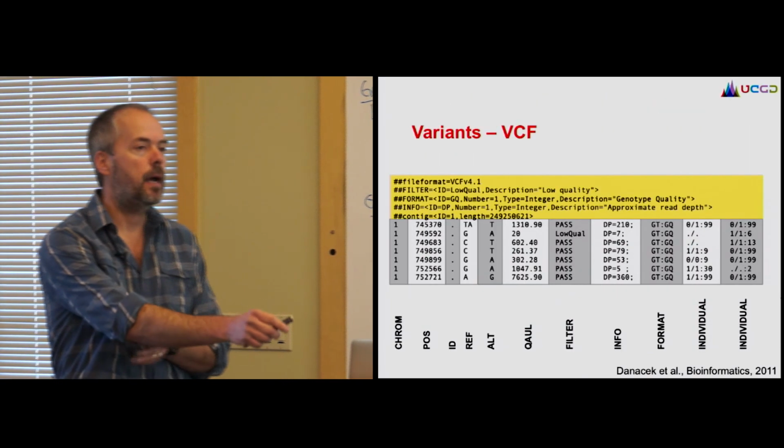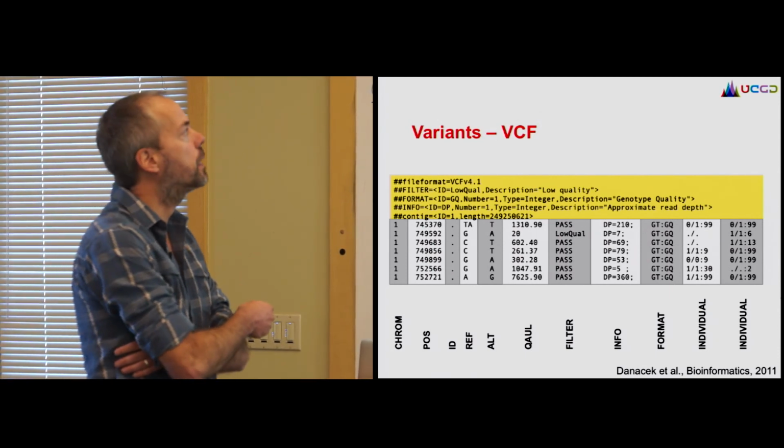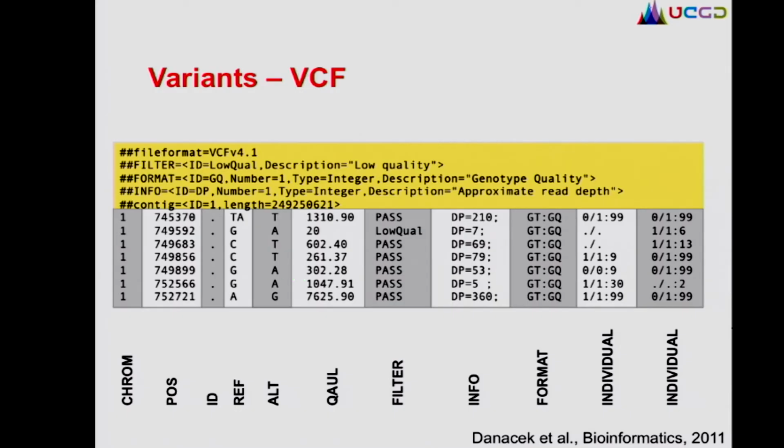Okay, so enough of that. I think you've probably already seen variant files and other types of files already this week. So we'll just briefly refresh our memory. The VCF file is where the variants are, some metadata at the top, tab delimited columns of information about each variant at the bottom. The initial data early on describes where the variant is, what it is, and a few bits of details about it. And then we have down at the end here this open-ended number of columns that describe for each individual in our data set how they are impacted, how they are affected with these alternate alleles that we saw earlier on.